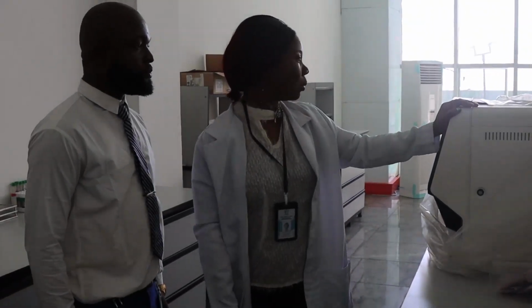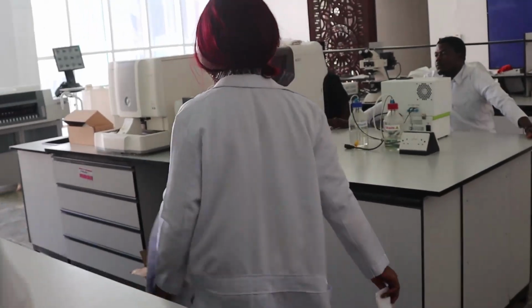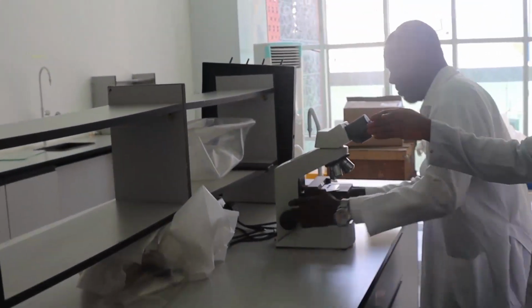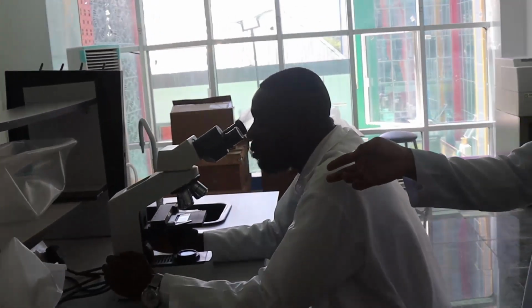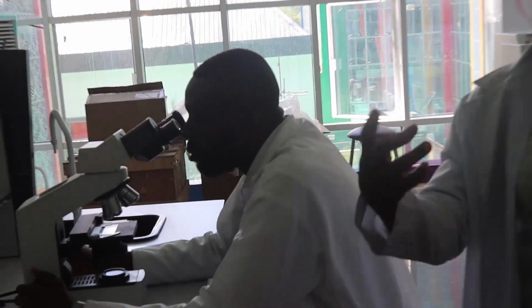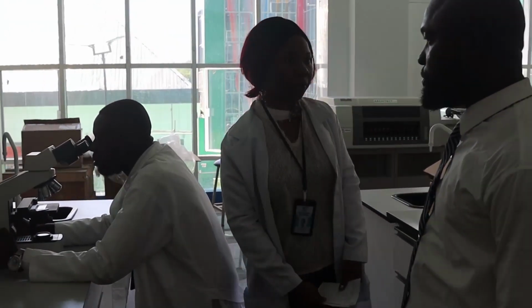So yes, we have our microscope. This is our microscope. We use the microscope to view those organisms that you can't see with your eyes.